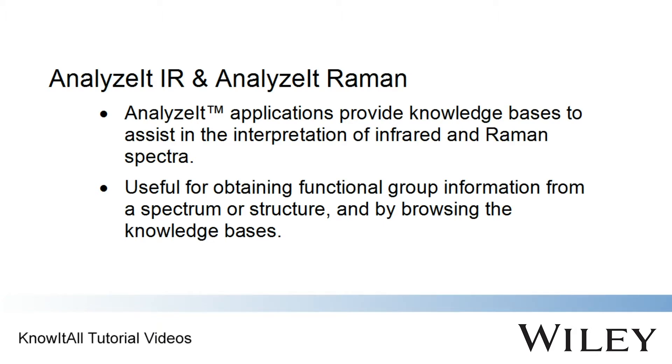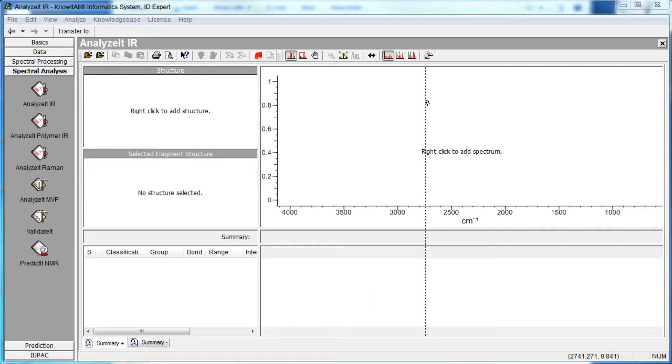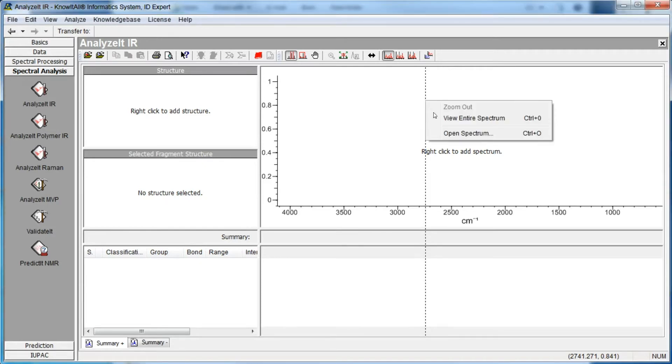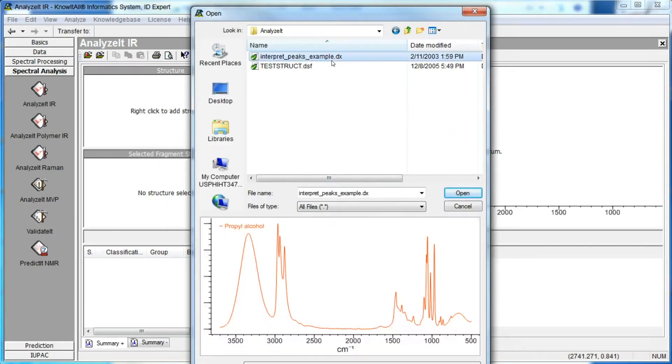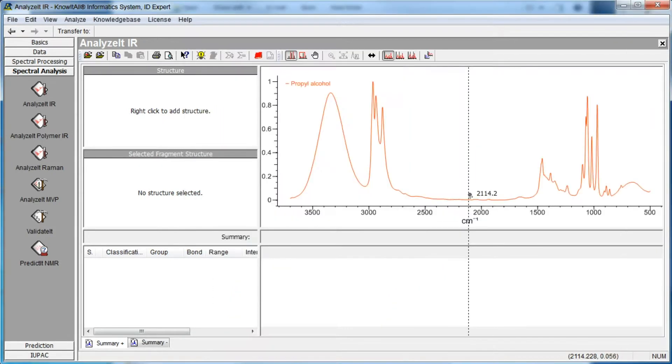They can be used to obtain functional group information from a spectrum, from a structure, and by browsing the chemical classes included in the knowledge bases. We begin by opening a spectrum in the Analyze-It-IR application and analyzing one of the peaks in the spectrum.